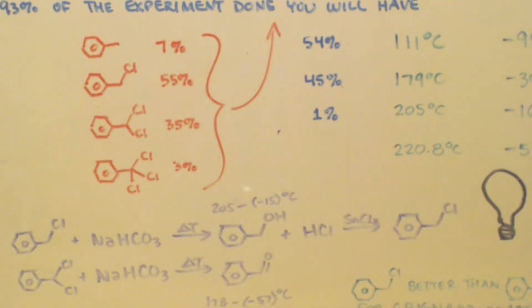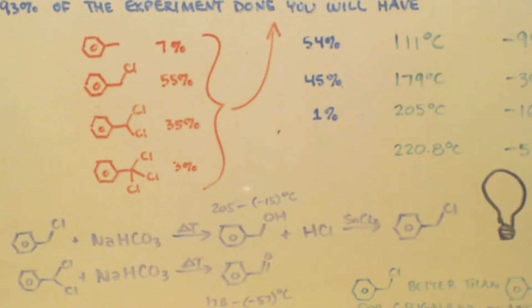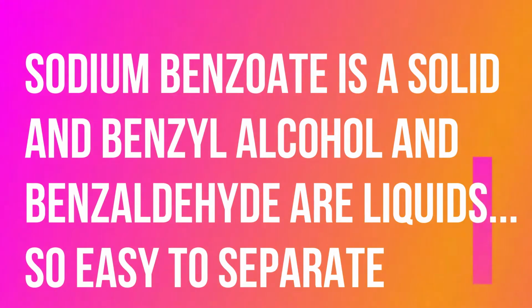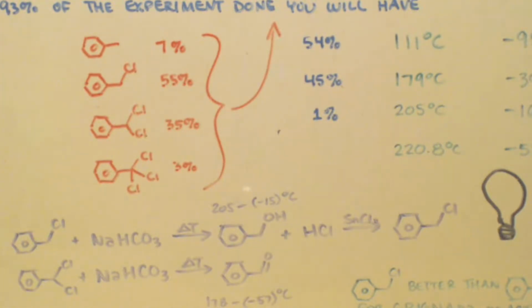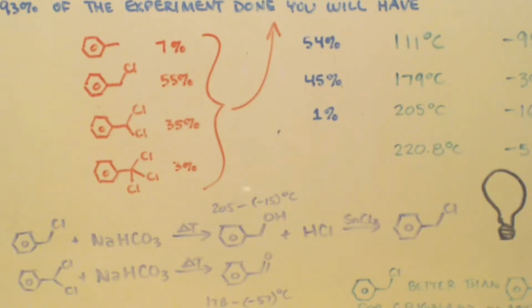So that is the easy part. If you wanted to make this and hydrolyze it into benzoic acid, because you won't have these impurities, you just chlorinate it until you get everything chlorinated. You know what I mean? So the only thing left on these videos right now is the hydrolysis. Okay, I only went into this generic little thing here. So the next thing we're going to talk about and get more in depth in is which temperatures are best to reflux it at, which salts are best to hydrolyze it with, and how you actually do it.